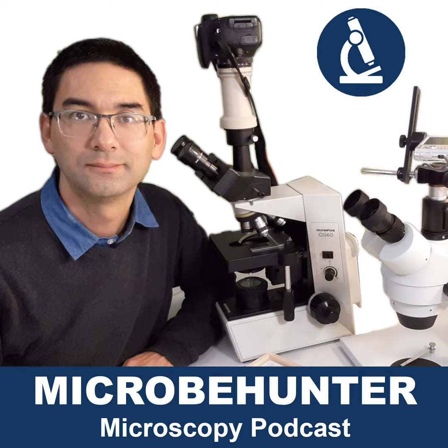Now, there are also some smaller microscope manufacturers that have an infinity program. The question is, should you go for that? And here I have mixed feelings. Because these are smaller manufacturers, it is more difficult to obtain second-hand and lower cost objectives this way.